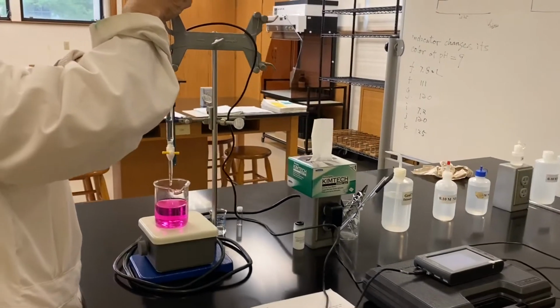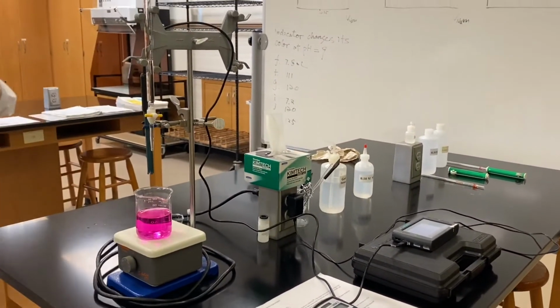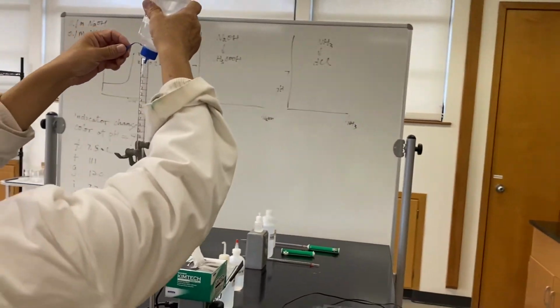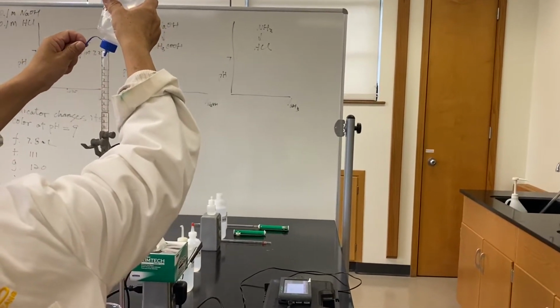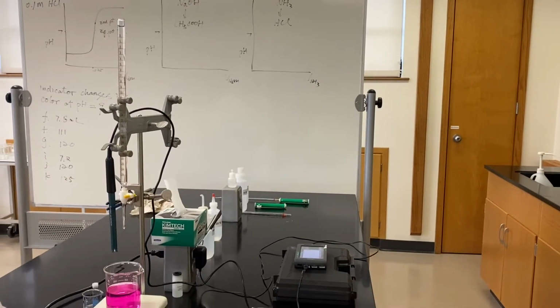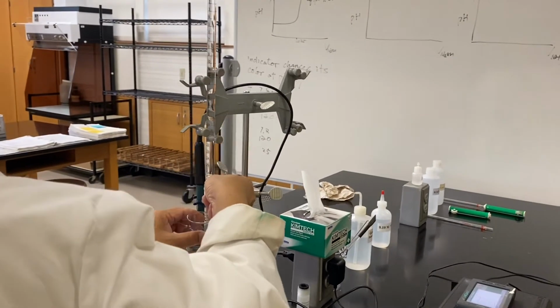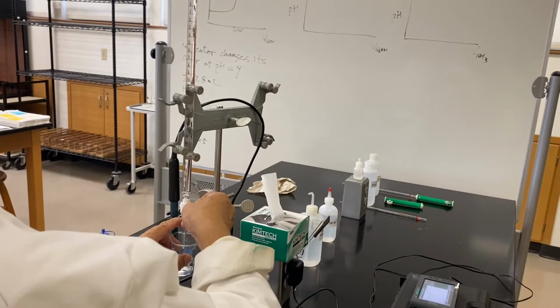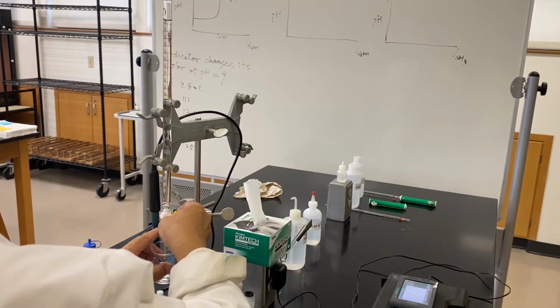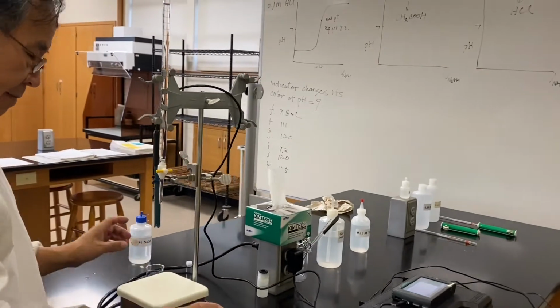Keep our titrant as our sodium hydroxide. All right. So what we're going to do is simply refill our burette with the sodium hydroxide. And of course, slowly but surely, and then lower the meniscus all the way to our 0. Beautiful. All right.